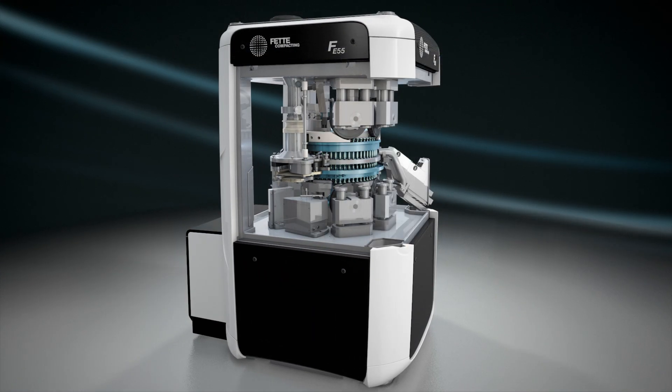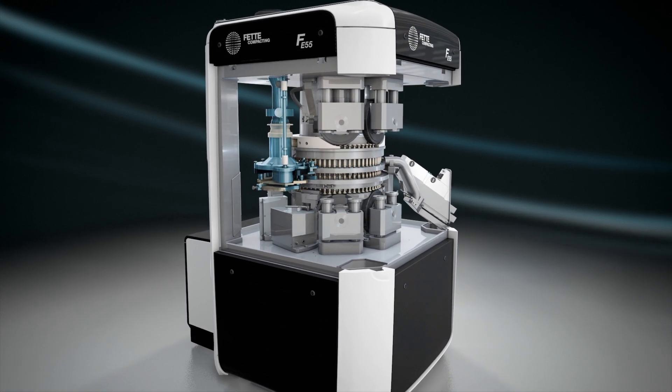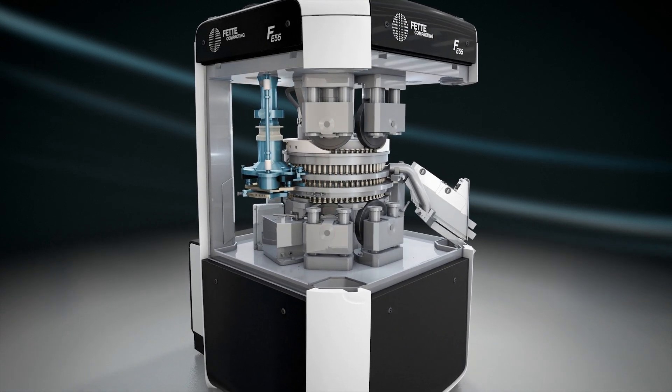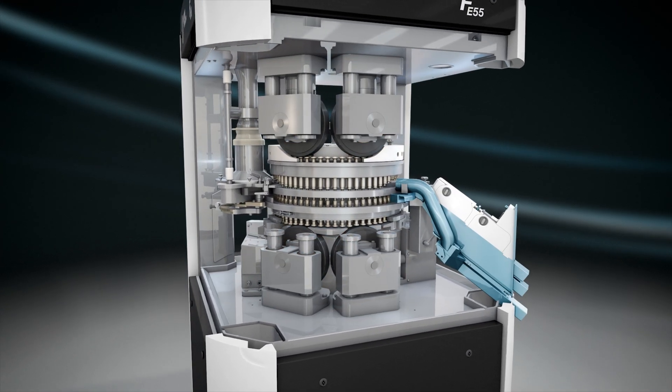In the tablet press area are the turret with the punches, the segments, a filling device, identical compression stations for pre- and main compression, and the tablet chute.